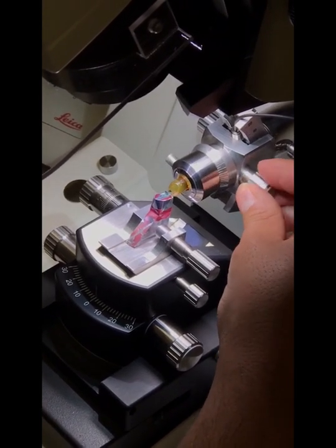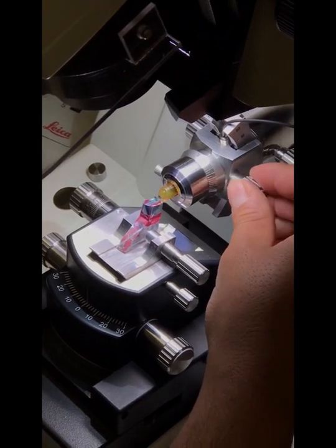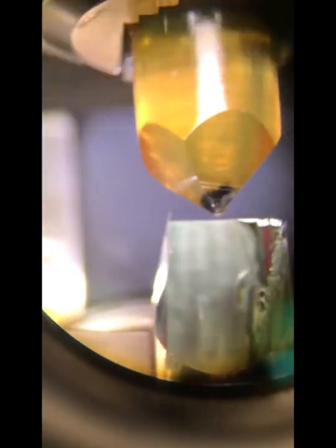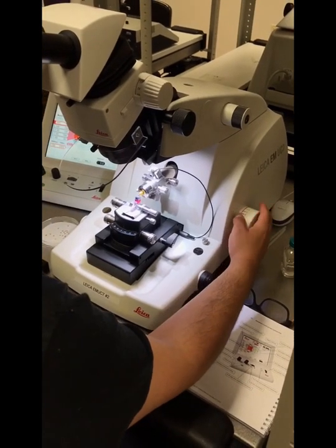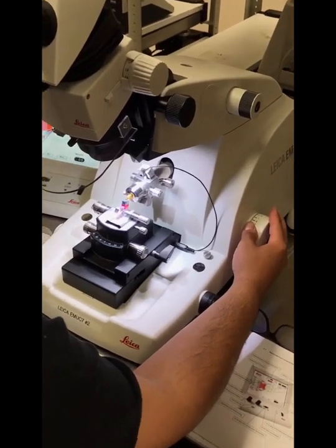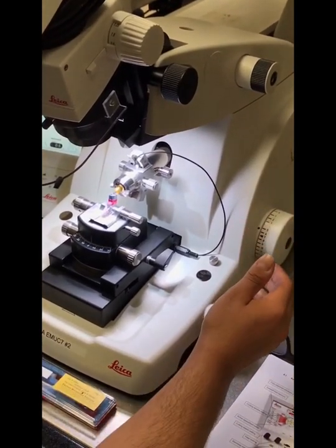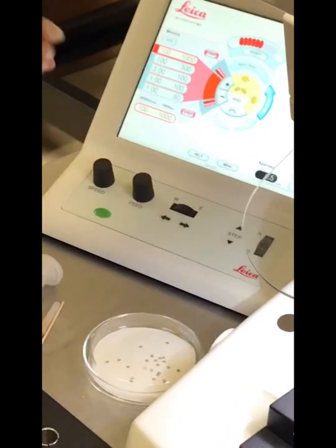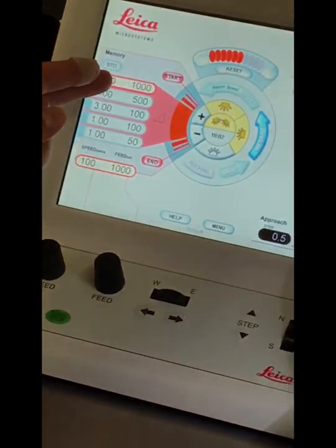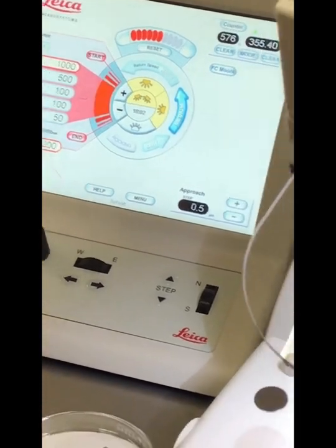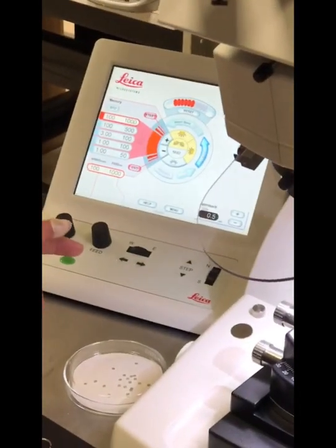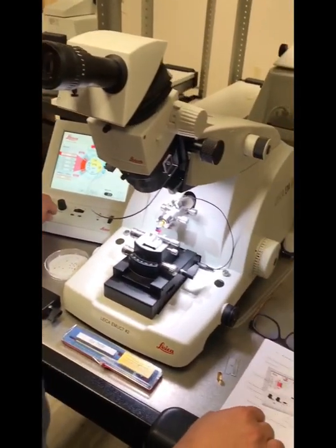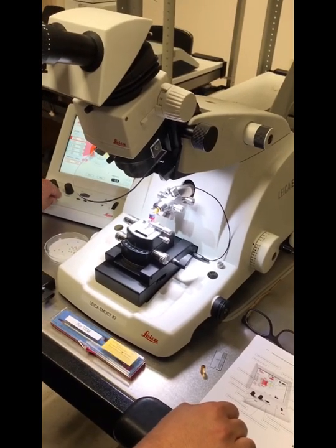So I'll use this screw right here. This is the rotation of the specimen holder. So once you're close enough to your knife here, once your block face is parallel and close enough, we can go ahead and let the automated settings take over. And if you look over here on the speed, it's at 100. And the feed in nanometers is 1000. So that's going to be our perfect size for thick sections. So we can go ahead and press start. And we want to keep looking just to make sure nothing crashes into the knife.